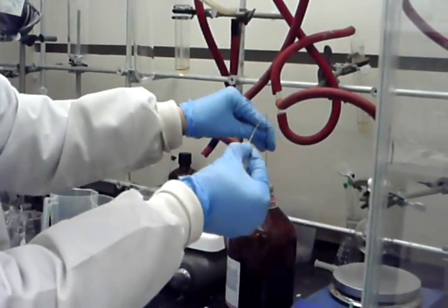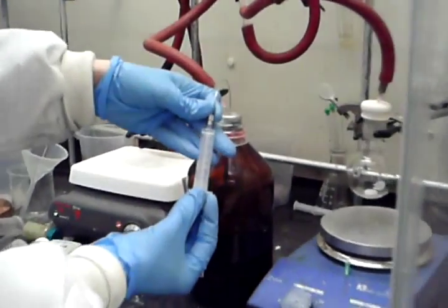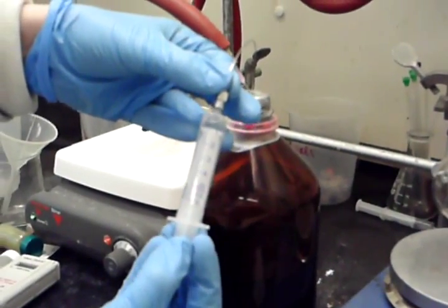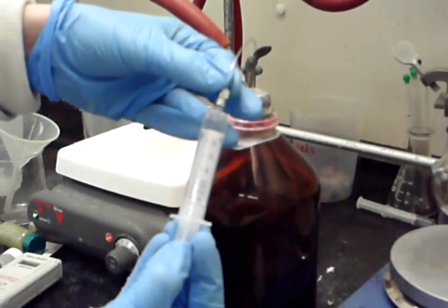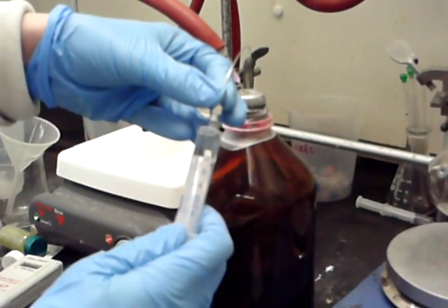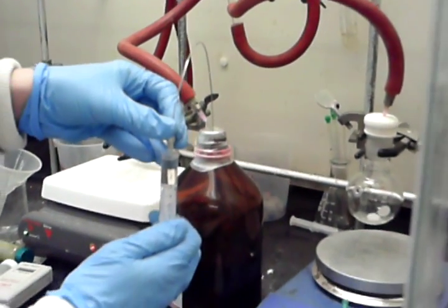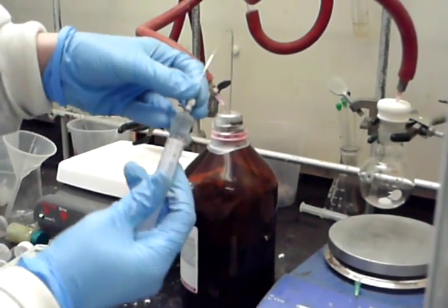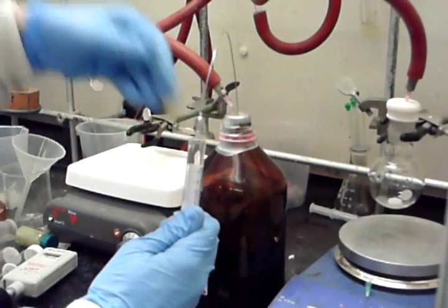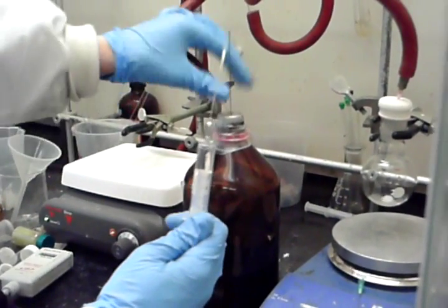Then you lower the needle below the liquid and slowly pull. Use one hand to ensure that the needle is secured to the syringe — that prevents you from creating too large of a vacuum and the plunger shooting out the air-sensitive reagent. Say I want two mils: pull a little extra in, pull the needle up above the liquid, then measure what you want. I want two mils. Then pull a nitrogen bubble on top, because any bubble left in here will shoot out the air-sensitive reagent.